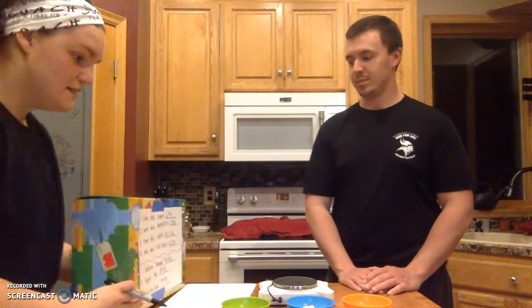So what that tells us is that this large amount of salt that I have is the same count of sodium chloride units as this teeny, I wish you could see, this teeny bit of water. Okay, it's not very much water. It's only like filled to there.